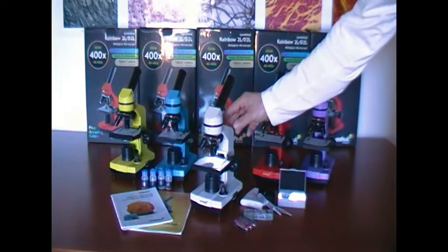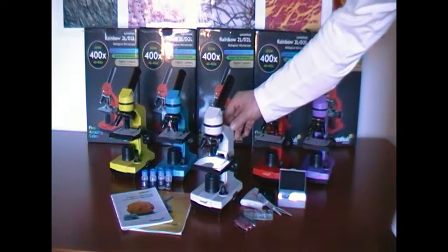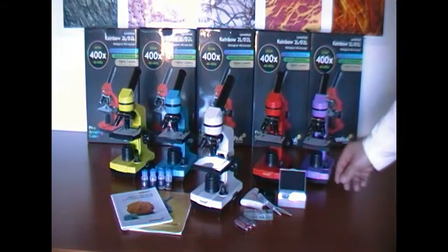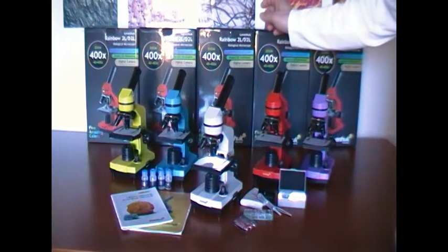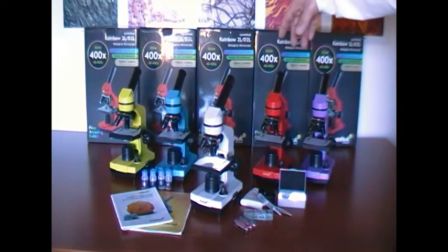Hello. I would like to introduce you to the Levenhuk Rainbow 2L microscope. This microscope is a biological one. The magnification power of this microscope is 40x to 400x. We offer it in these five colors.